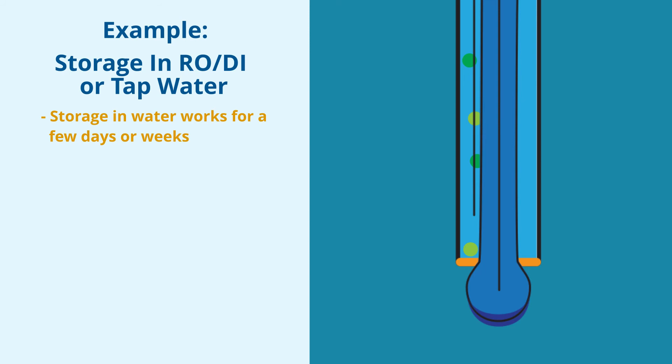When left in water, the gel stays wet, but the potassium and chloride ions in the electrolyte slowly diffuse through the junction to reach ionic equilibrium with the water. This also happens anytime the sensor is in use, so storing the electrode in water is essentially reducing the lifespan of the electrode by however long it's in storage.